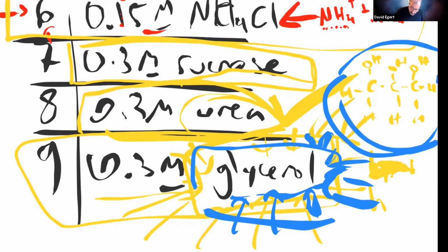Right. So glycerol, particularly with the cow blood, penetrates, but it penetrates pretty slowly. So for the procedure you're going to see on the video, we added an extra tube, tube 9, with a star on it, which is the same thing.